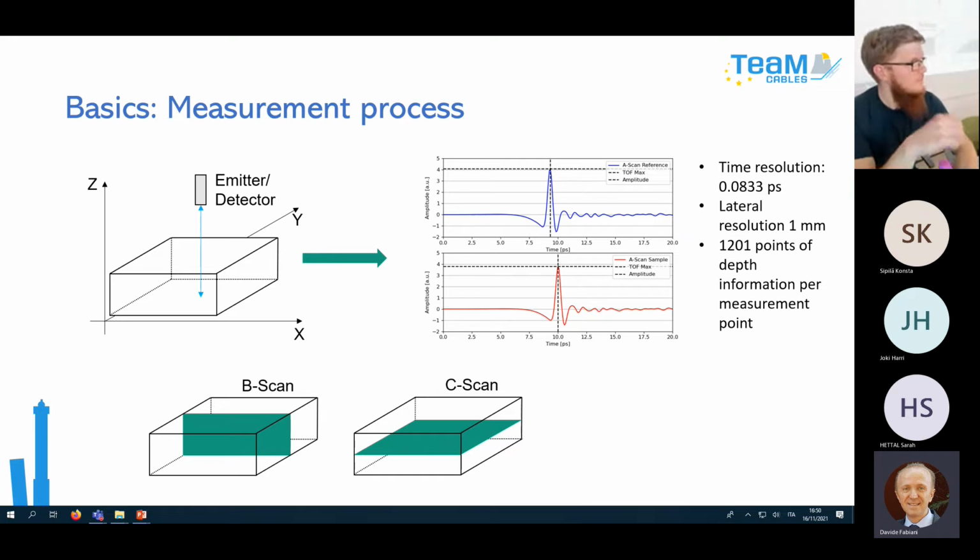Okay. Because to calculate the permittivity value, you need to have the value of the thickness at the exact point. Okay. Yeah. That's an issue, but maybe with a laser profilometer where you can get the exact thickness, you can calculate the permittivity for every point in the y direction.